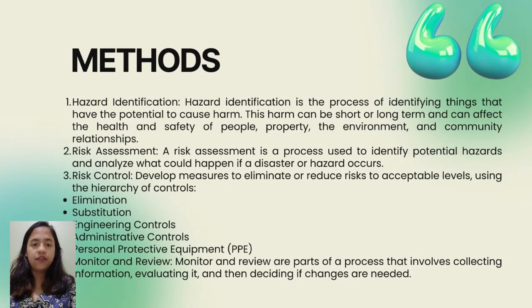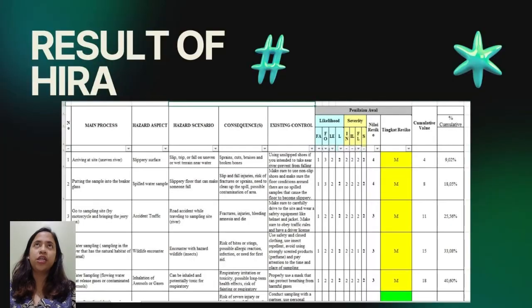And the last is monitor and review. That is the last step. It means the part of a process that involves collecting information and evaluating the risk assessment and risk control, and then deciding if we need any changes.